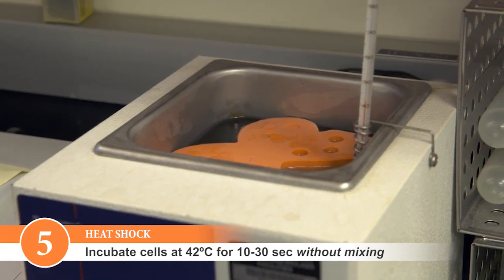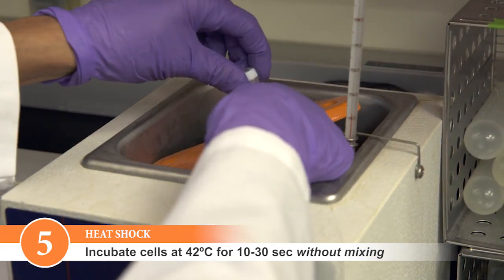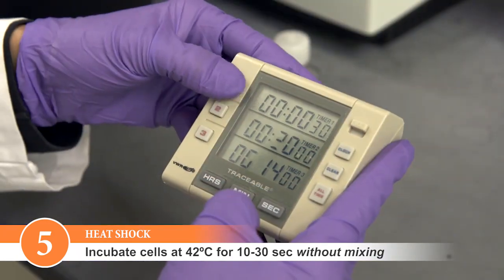Heat shock the mixture at 42 degrees Celsius for 10-30 seconds depending on the strain. Do not mix.